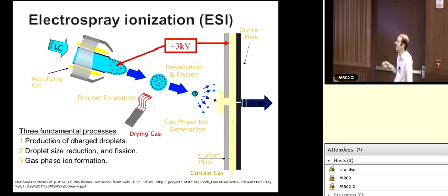And so the exact mechanism by which this takes place is still somewhat debated in the literature. I guess we're getting closer to a complete understanding of it, but not totally there yet. But suffice it to say, we produce gas phase ions.